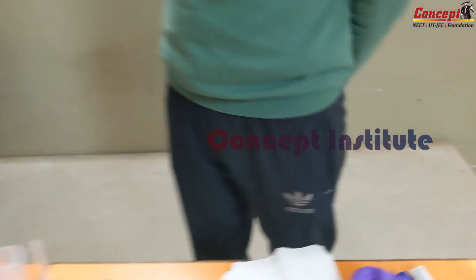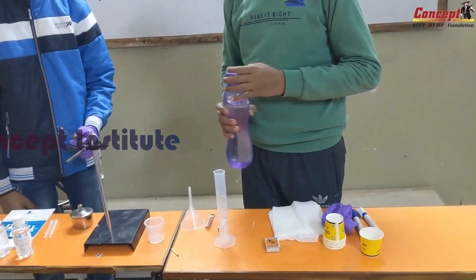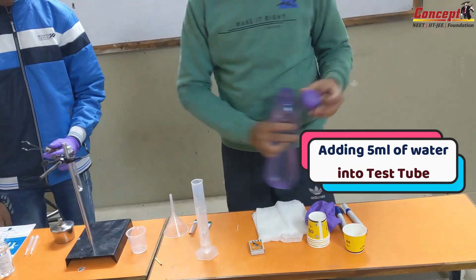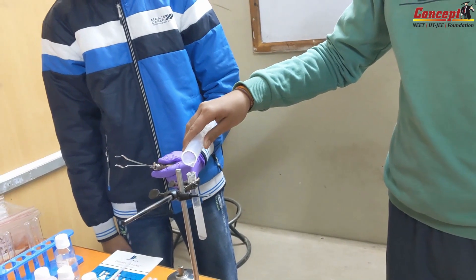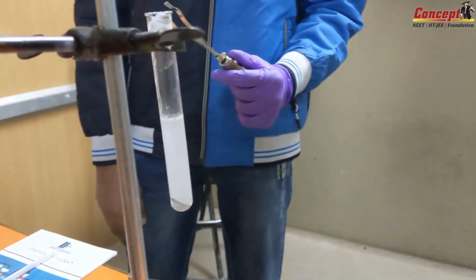So now put some water in this tube and then pour it down. Add this water to this test tube. What does this solution look like?